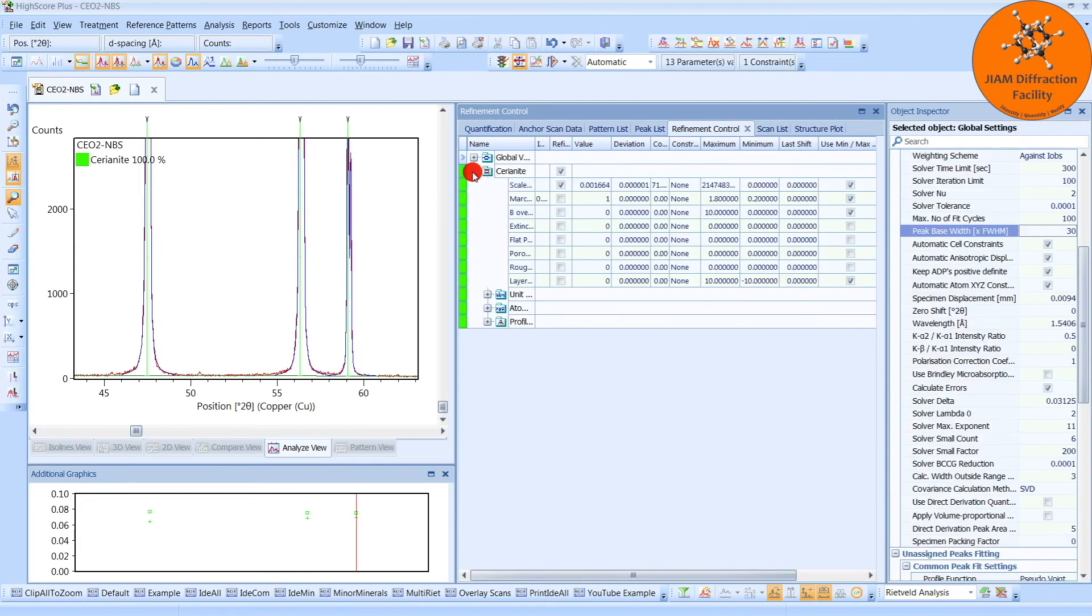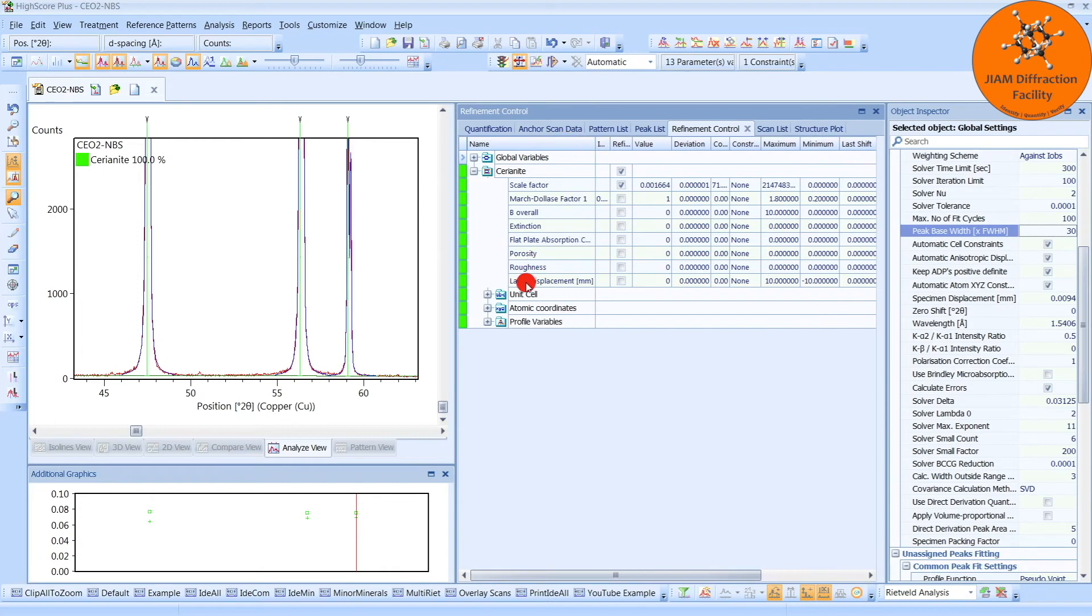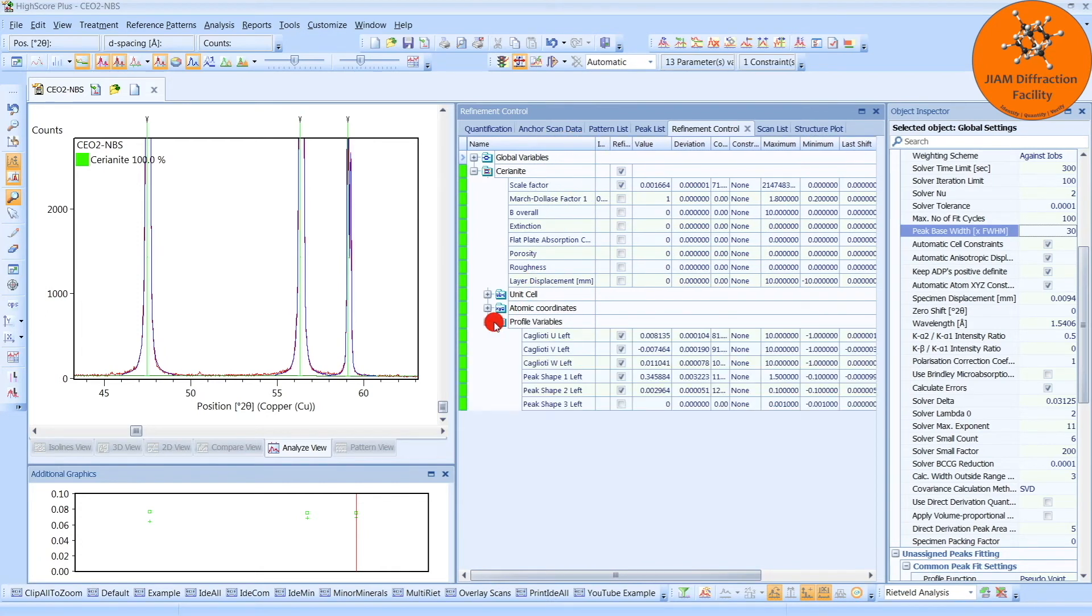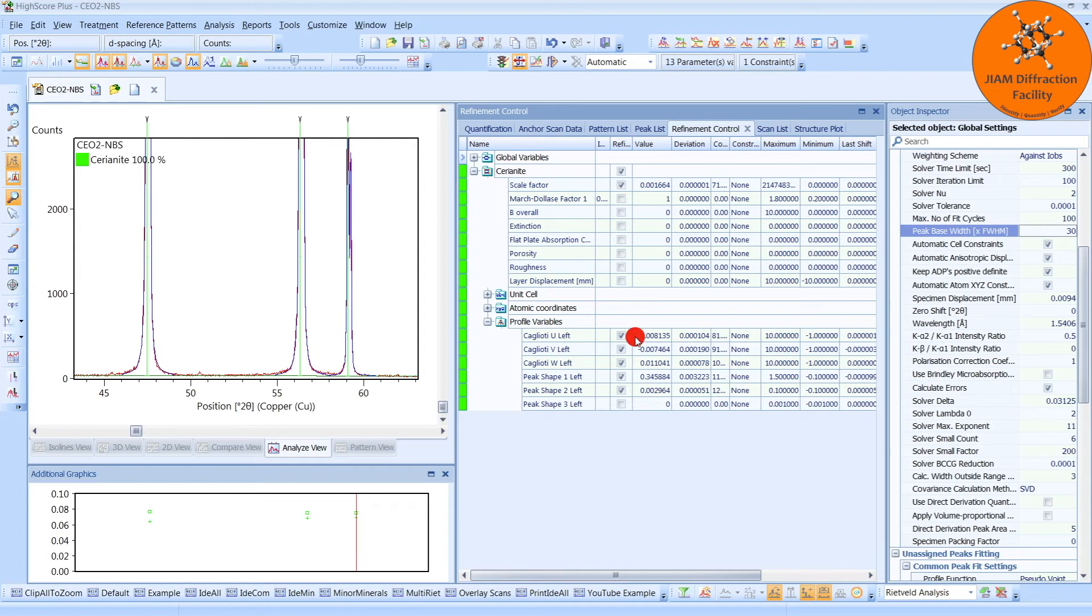Let's left-click this little plus sign next to the phase. And then we will click the plus sign next to the profile variables. And we see that we have five different profile variables that are refining. Here are their values. It is these variables that give us the instrumental broadening that we need to use in order to determine the sample broadening that we get from our diffraction pattern. So we want to save these values.